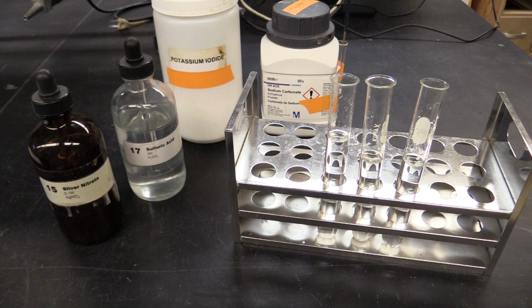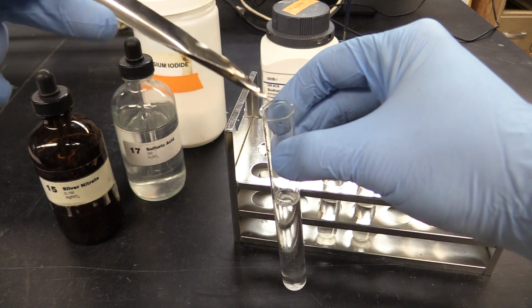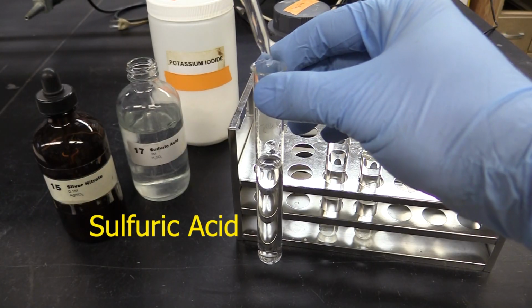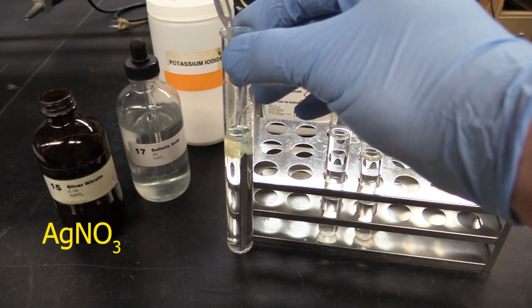Of all the different reactions that take place in this experiment, the one I'm going to cover in this video is the silver nitrate test. To perform this test, you bring your anion into solution, add a little sulfuric acid, then add some silver nitrate and see if you get a precipitate.